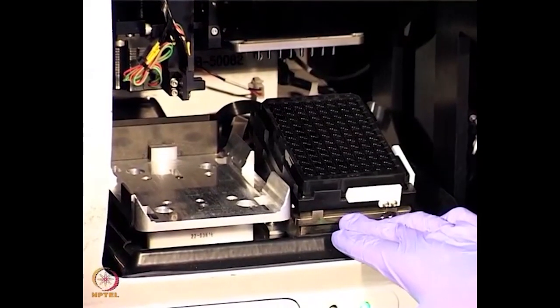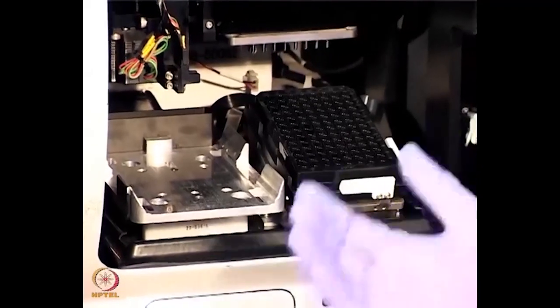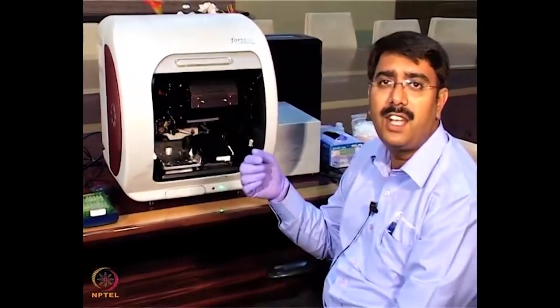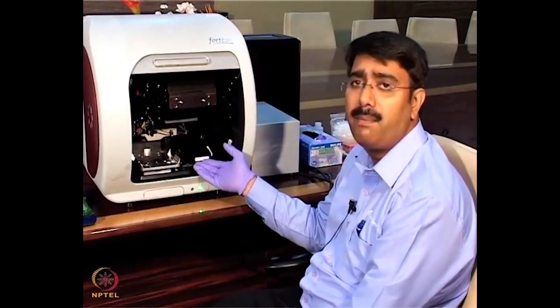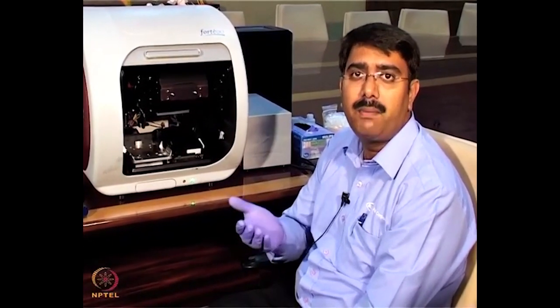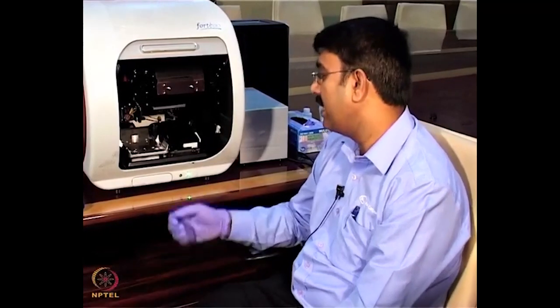Here we do not have any microfluidics devices, so to assist binding, we have a shaker. That shaker assists in the binding. The shaker works from 150 RPM to 1500 RPM. And the sample plate also has temperature control. We can work from the ambient room temperature, like 23 plus or minus 4 degrees, up to 40 degrees centigrade.